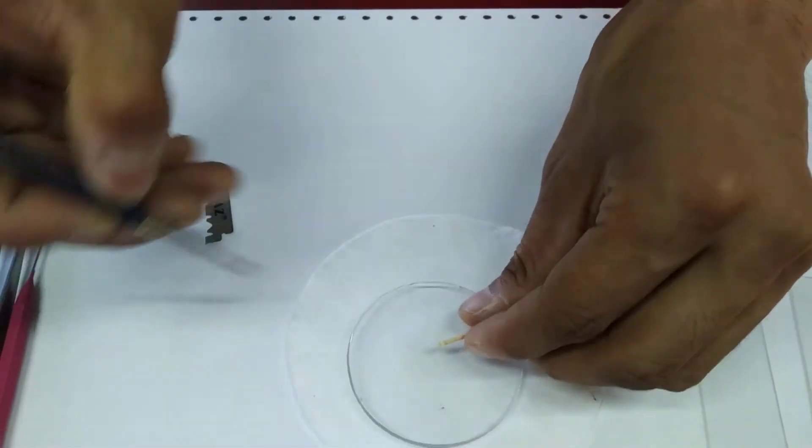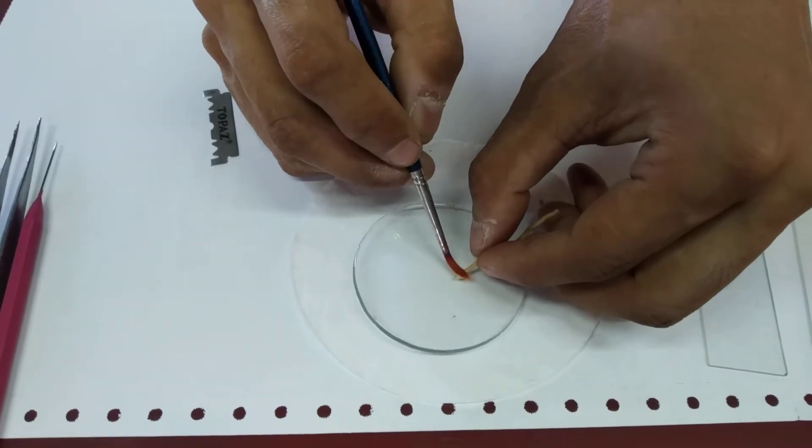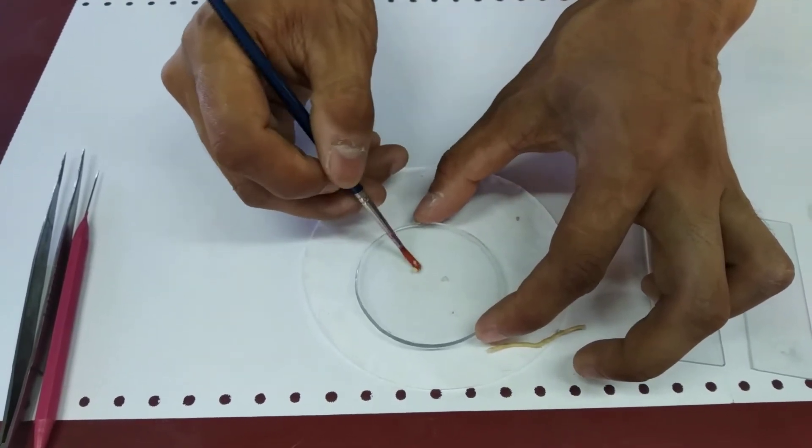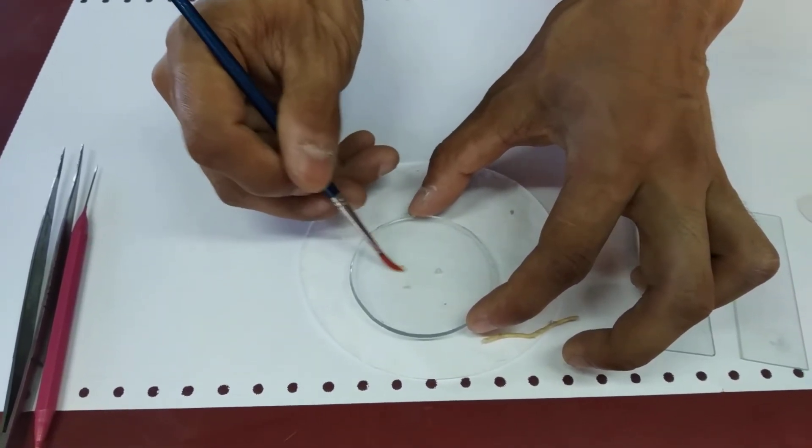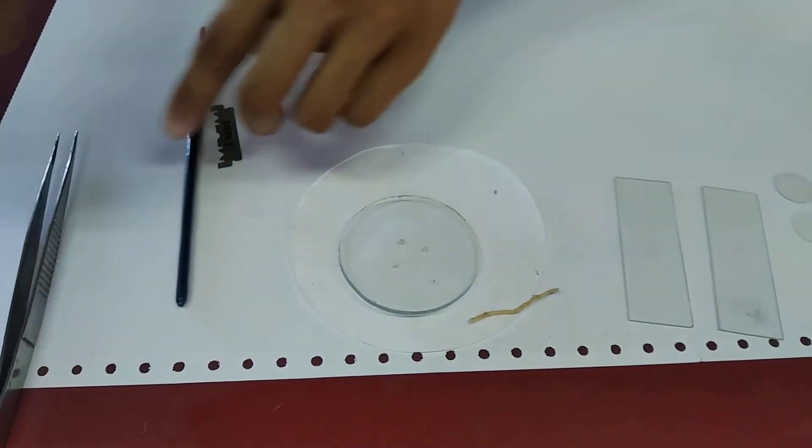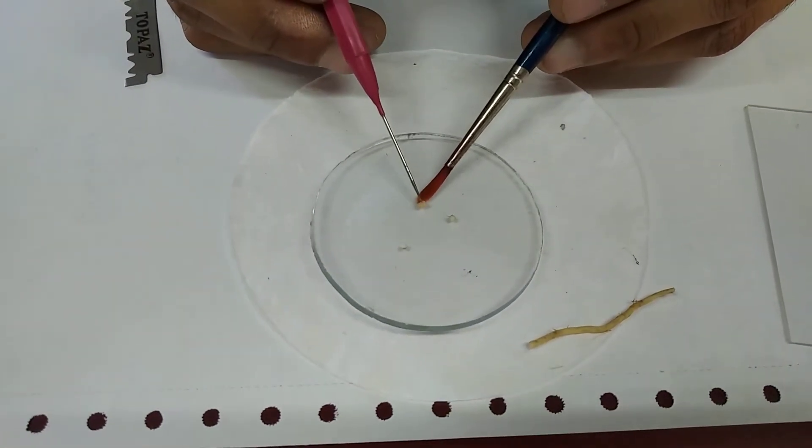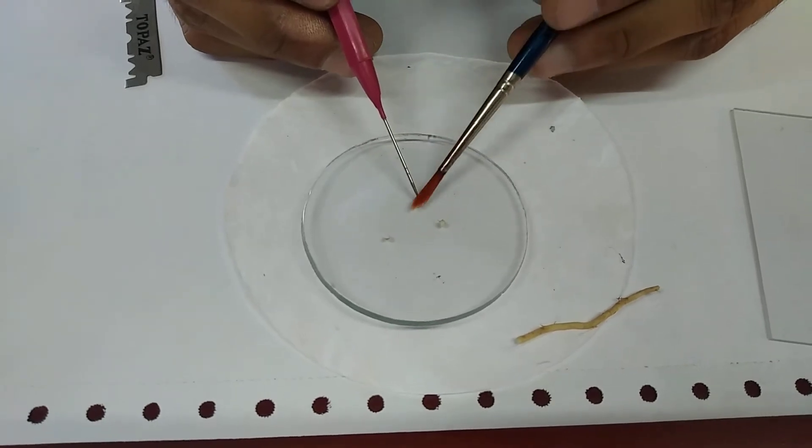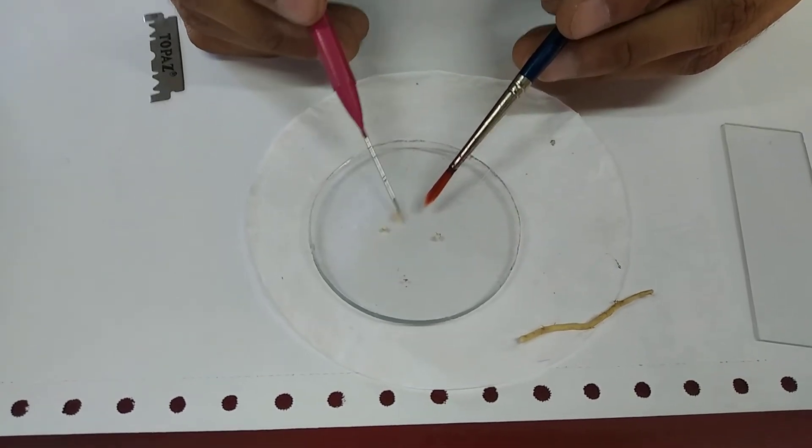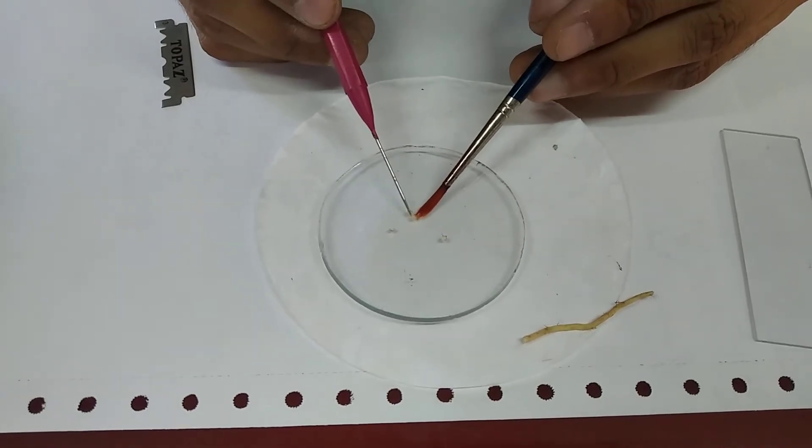After cutting the sections, transfer them to a watch glass. Cut many sections and select the thinnest one.